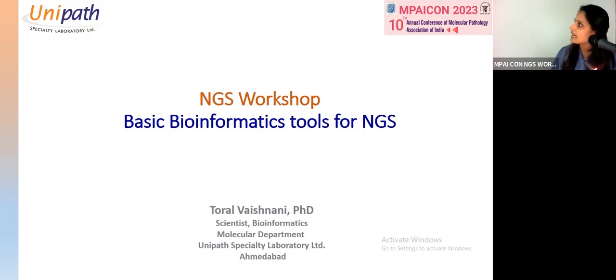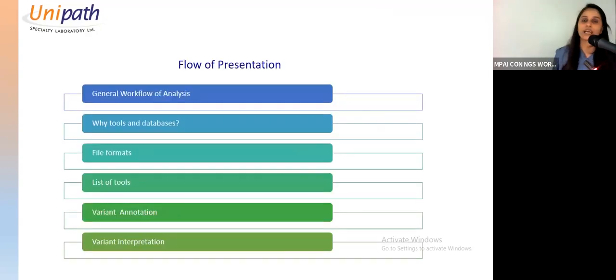Your topic is again NGS, so it covers everything. But as we are from the diagnostic field, this presentation concentrates more on the tools used in diagnostics. What I'm going to cover is a general workflow, tools and databases, a list of tools, variant annotation, and the hot topic, variant interpretation.